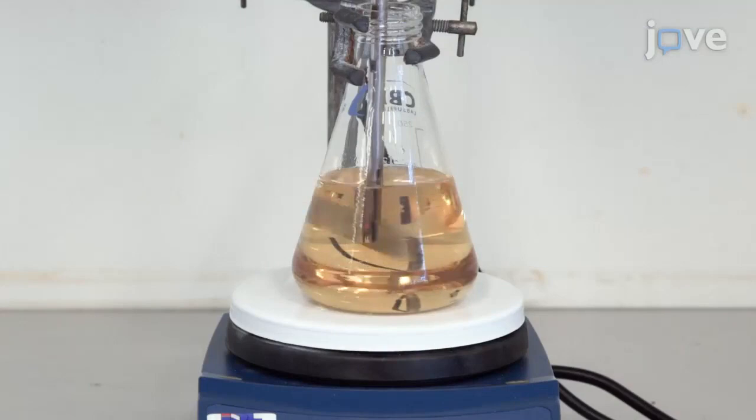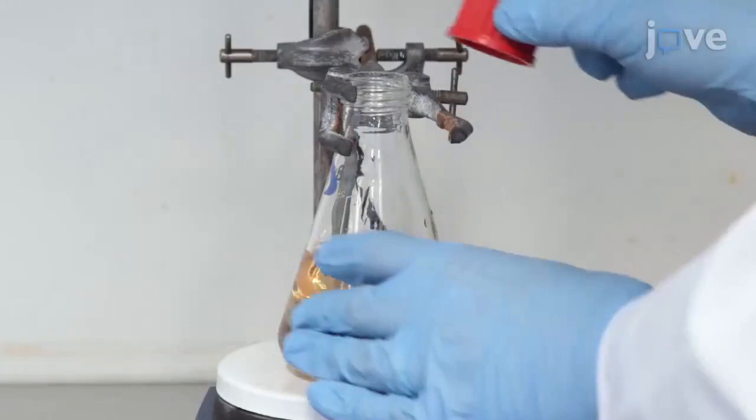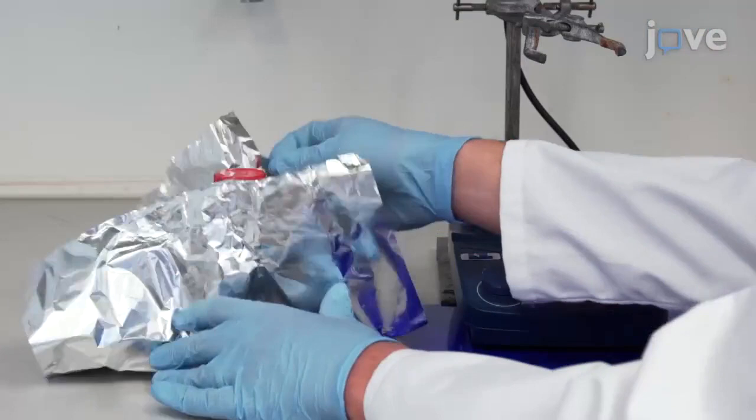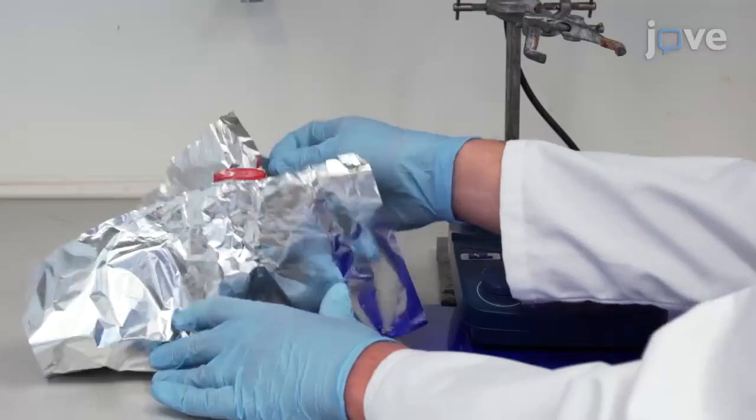Remove the mechanical stirrer and fit the flask with a stopper. Wrap the flask in aluminum foil to protect the bio-based acrylate photopolymer resin from light.